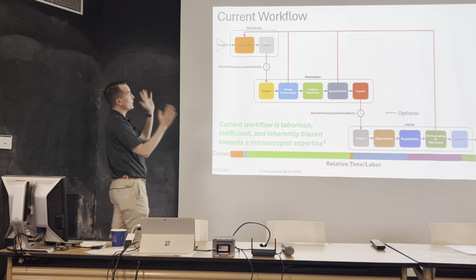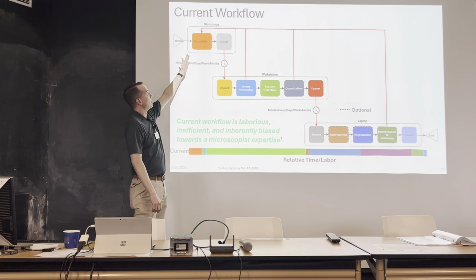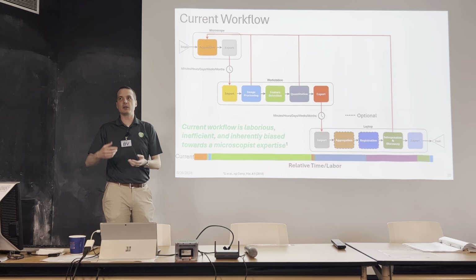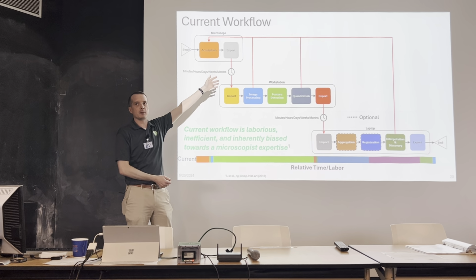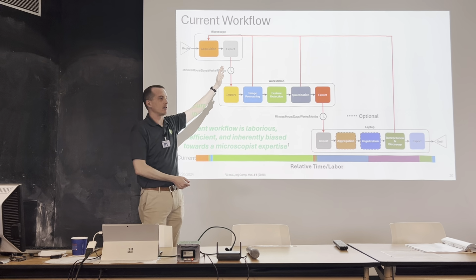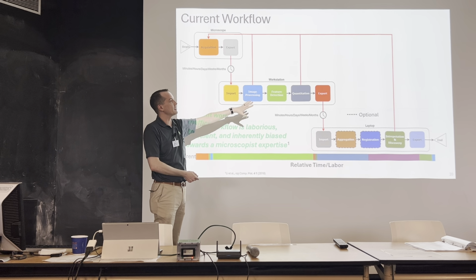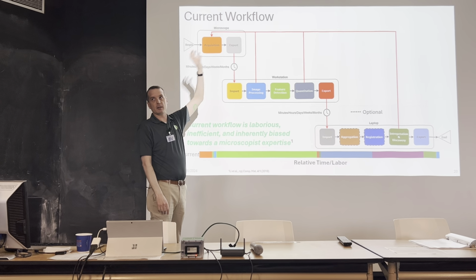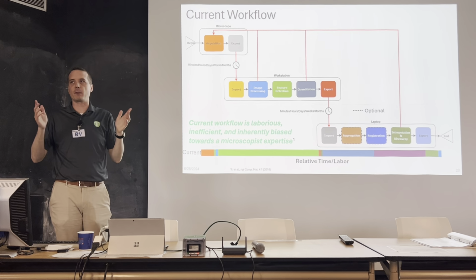And so this is our current workflow for working on a transmission electron microscope. You start off with your acquisition. You will collect your images. You will collect thousands of them because you're not sure if that was a good image, a good sample or not, and you don't want to miss anything. You export that. If you're unlucky, you will burn that to a DVD. If you are really unlucky, you will put that onto a floppy disk and take that across the lab to your office. You will generally import that then into some other workstation that has more horsepower, compute power essentially, than the microscope controlled computer, because all these microscopes were bought in the early 00s and they were dipped in concrete and you were not allowed to touch them, and they're all running Windows XP.